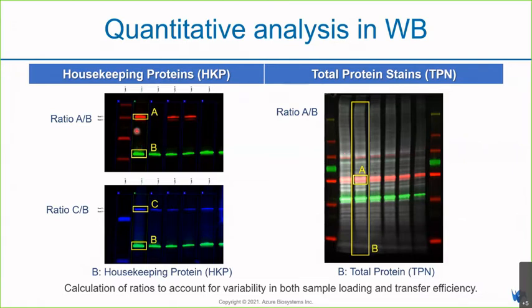But in the same blot, if they are very near to each other, you have to strip and reprobe the blot with the second antibodies later on. So this is to determine the relative target abundance in the different samples. For example, you have different samples in different lanes.